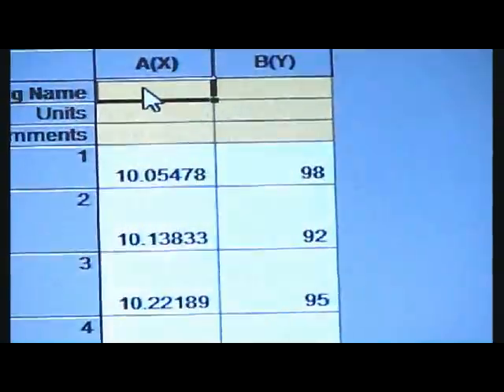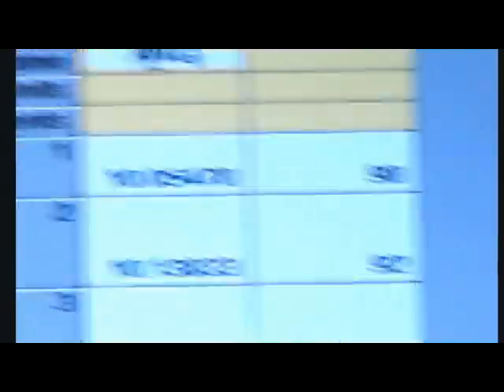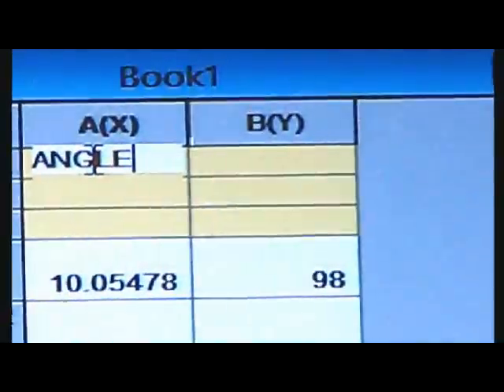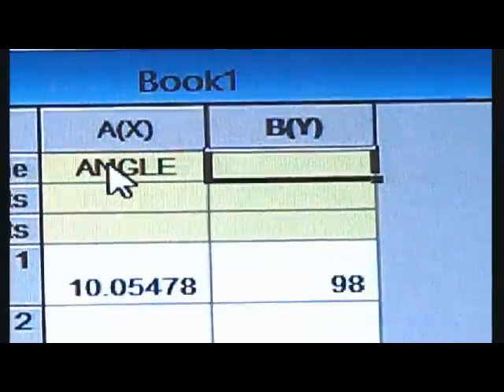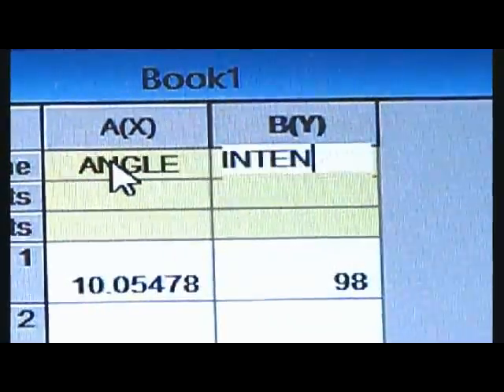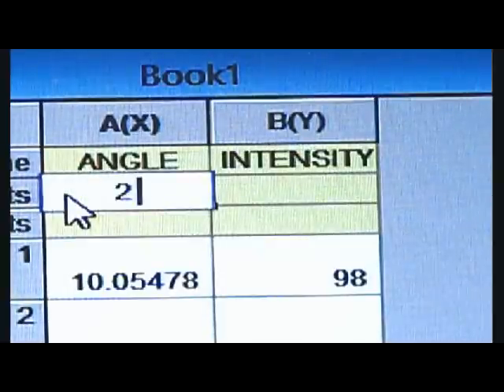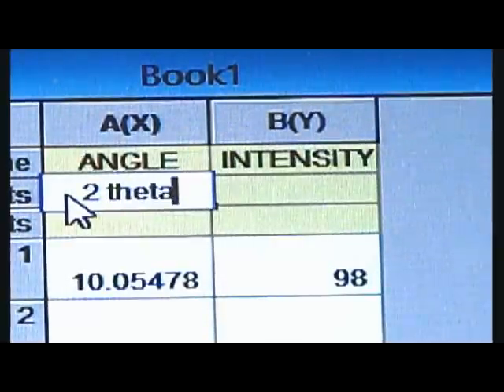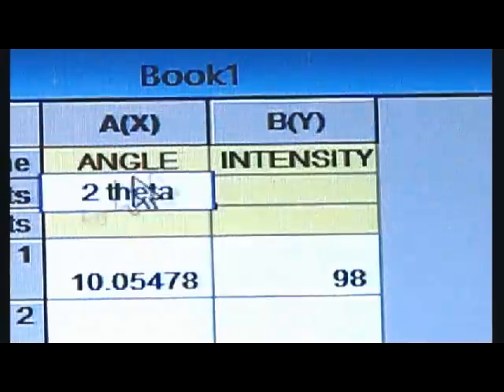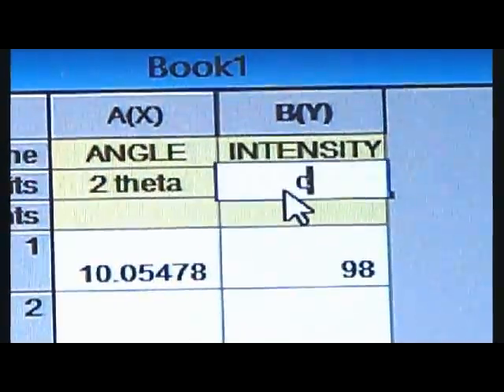Now we get only the angle and intensity values. Now we have to write the long name as angle and the Y as intensity. The unit of angle is in 2 theta and that of intensity in counts.